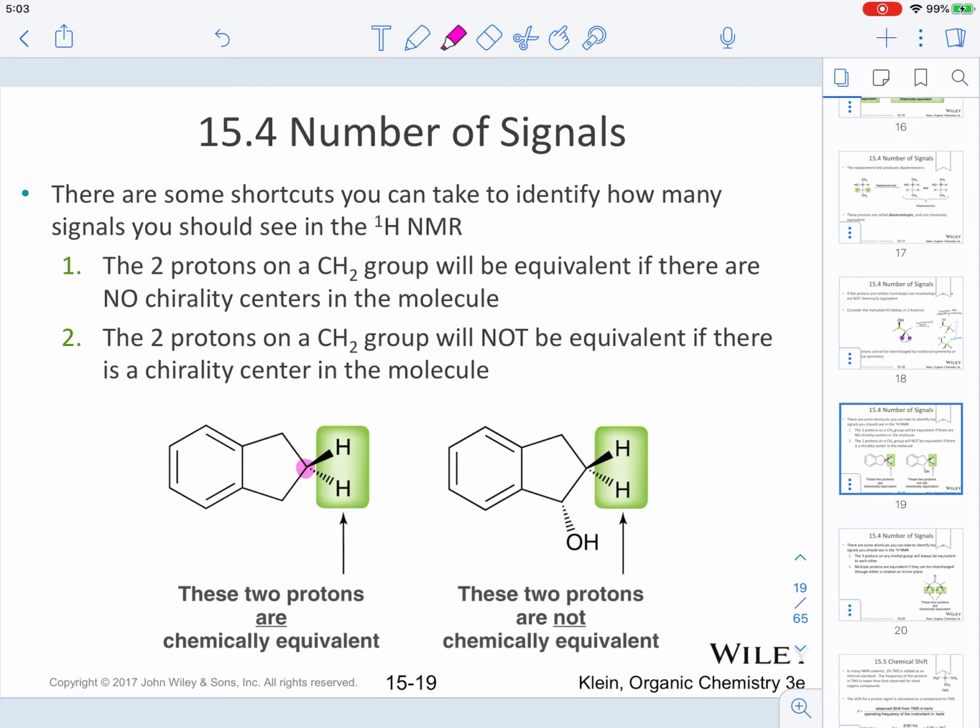Okay? Now, how do I know that there's no chiral center? Look at the molecule, which I'm going to now draw a dotted line through. If you look at it in half, it looks the same in the top part and in the bottom part, as we move along. Let me just highlight those bonds.